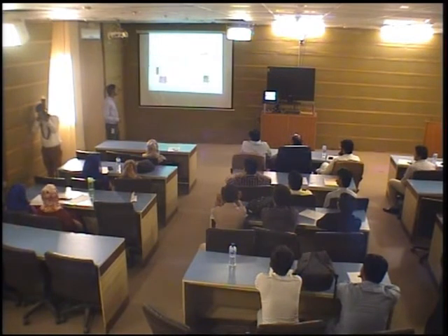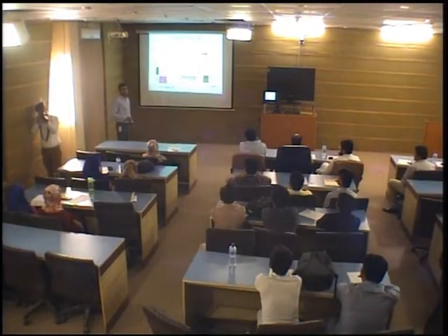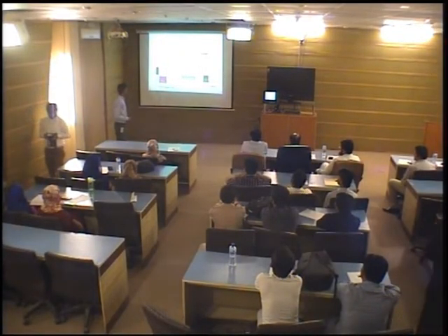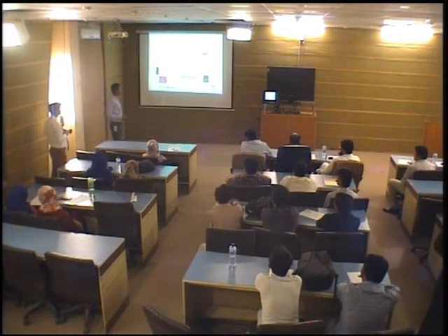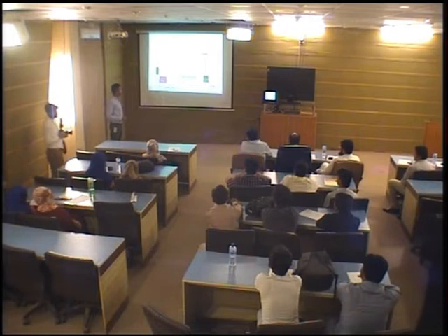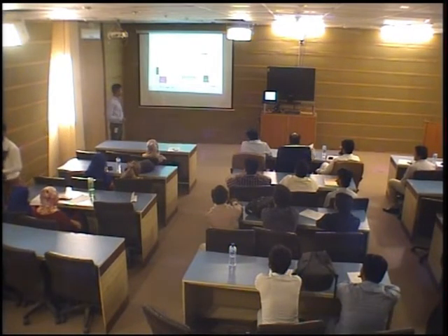Experimental setup. The experimental setup basically consists of an Nd:YAG laser, power supply unit, reflecting glass, focusing lens, target sample, optical fiber, LIBS spectrometer, and finally a laptop.